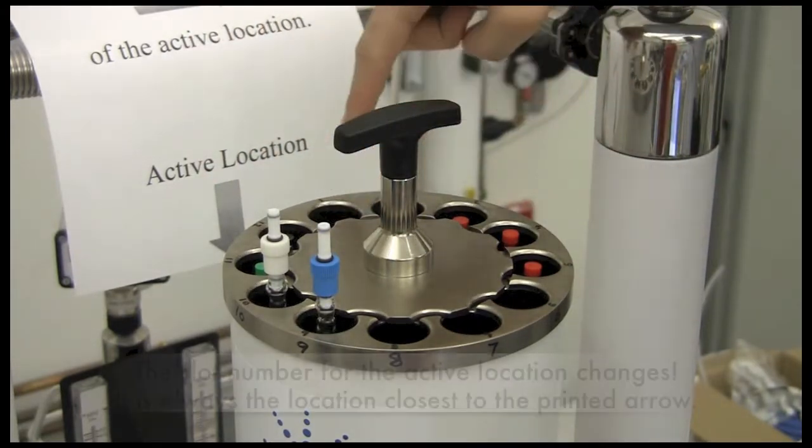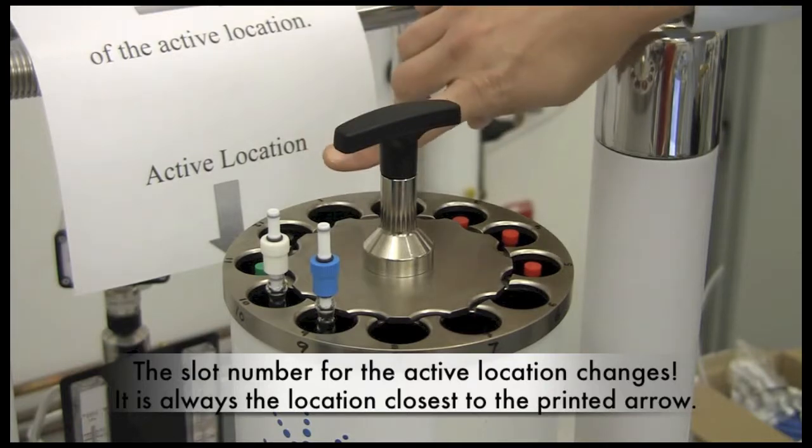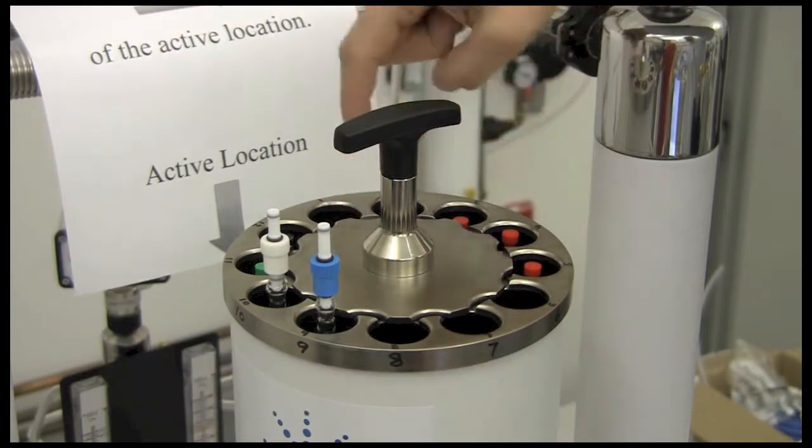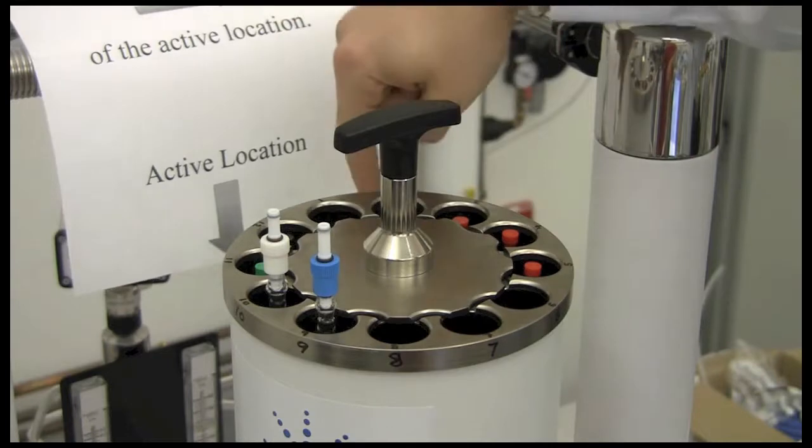The slot number 1 is the active location, and you should never put a sample in the active location because there may be a sample in there already inside the magnet.